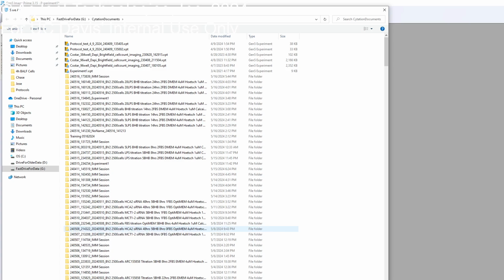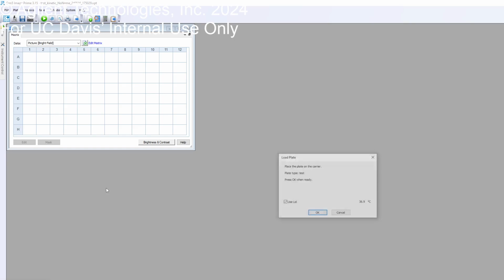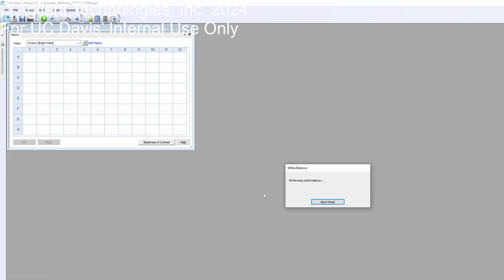Like in the kinetic experiment, over time you just image the same place once an hour. Then you put in maybe LPS and see if they go round, and then you can put in something else and see if they go back to the opposite. Yeah, you just do it times 10 data versus just taking the same cross section.